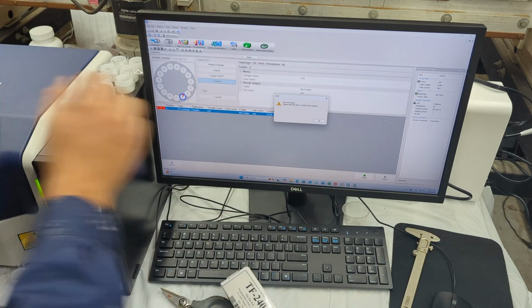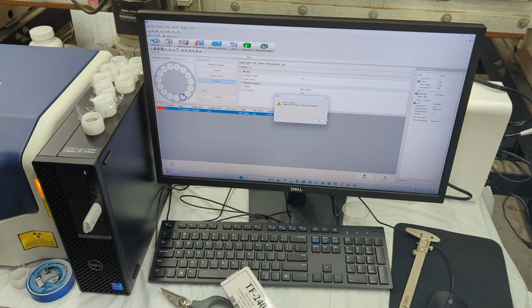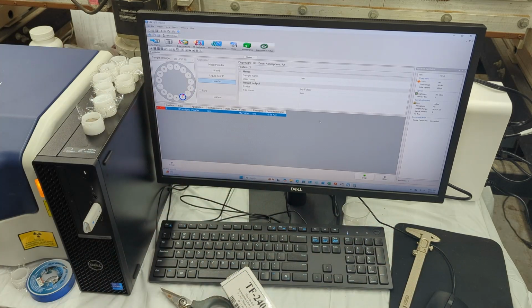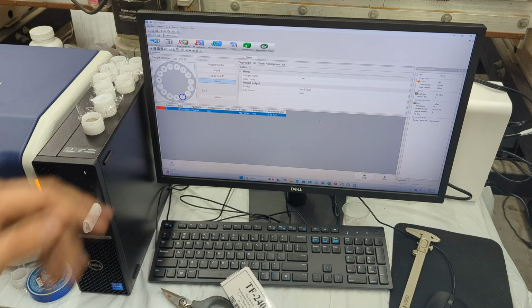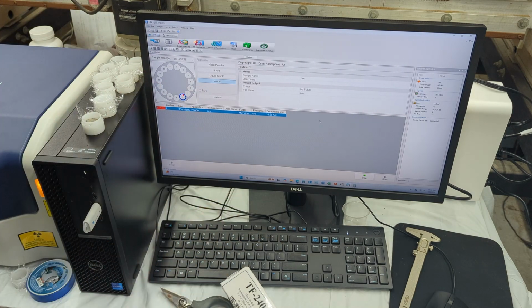So we'll close the door, click on OK again, and now it's going to give this a couple of times. There you go. Okay, so now it's running the software. It's going to take some time, and that is another downside of XRF measuring, but it's very, very useful. So again, to explain what the machine's going to do right now, it's going to run 3 different tests, and it runs them at 100 seconds each.